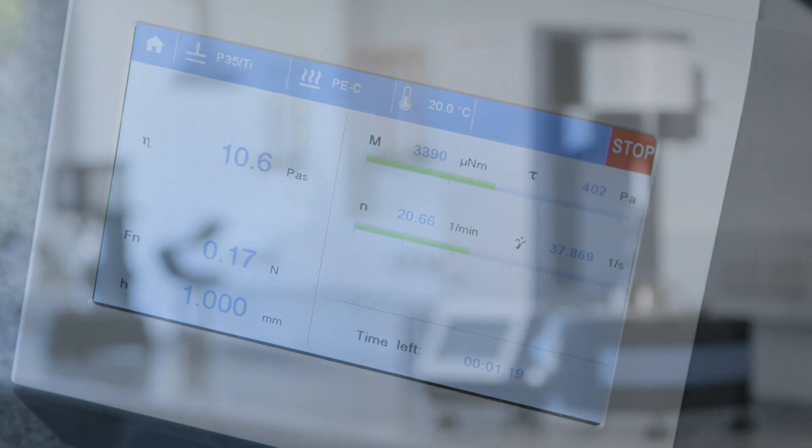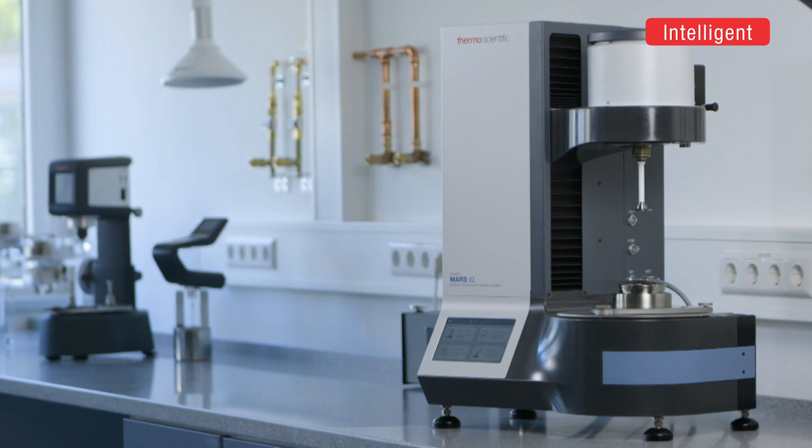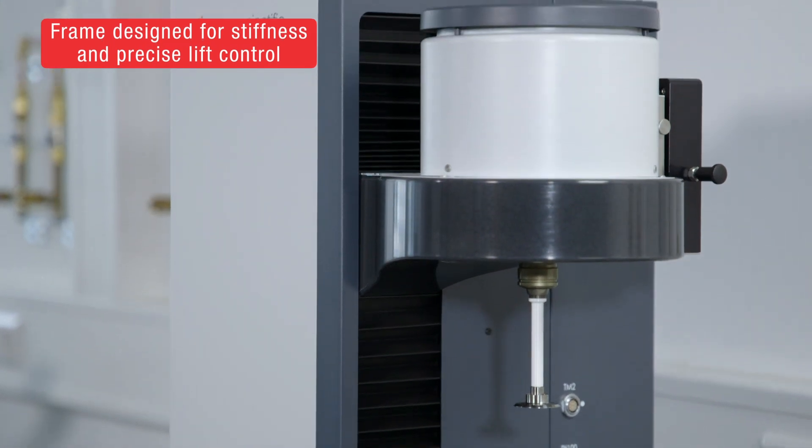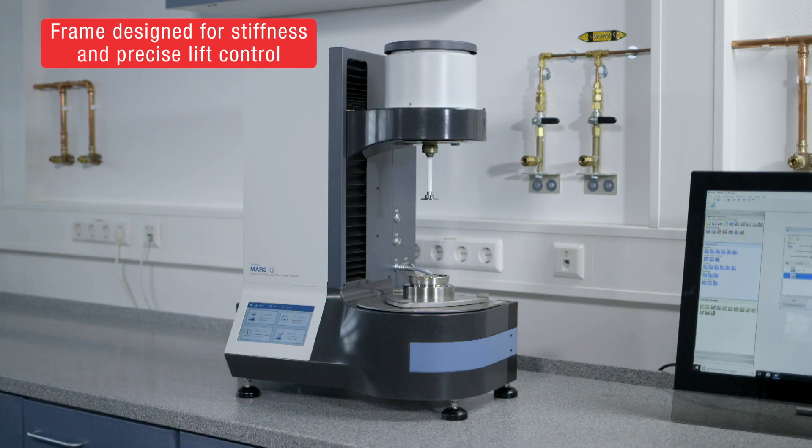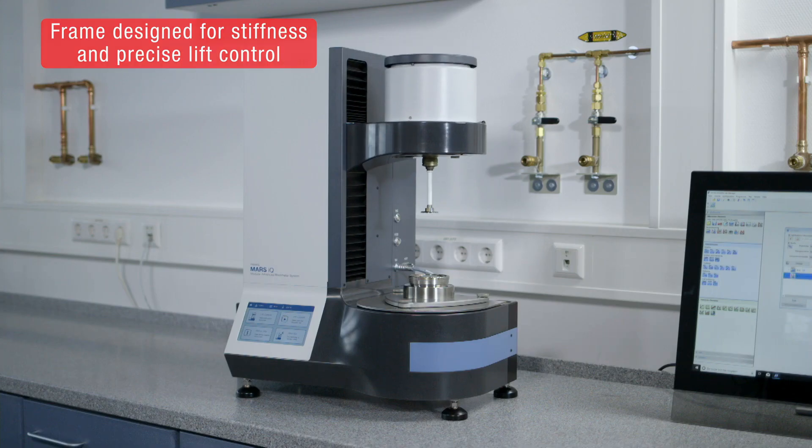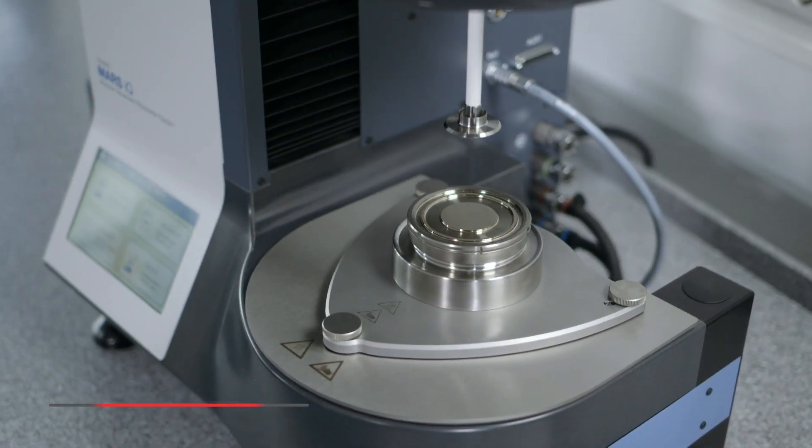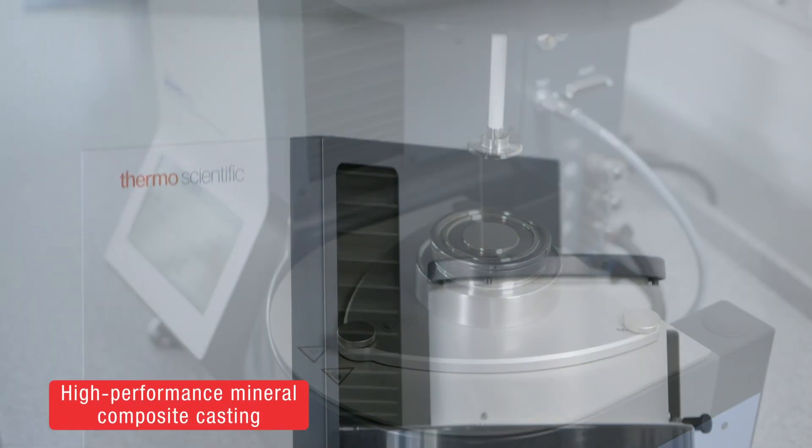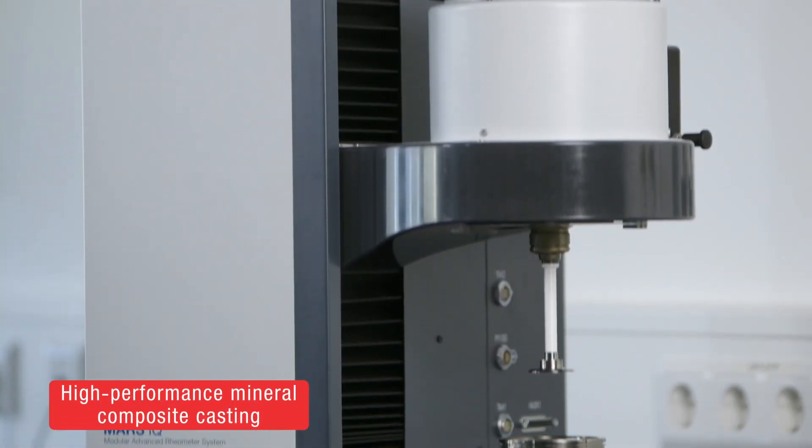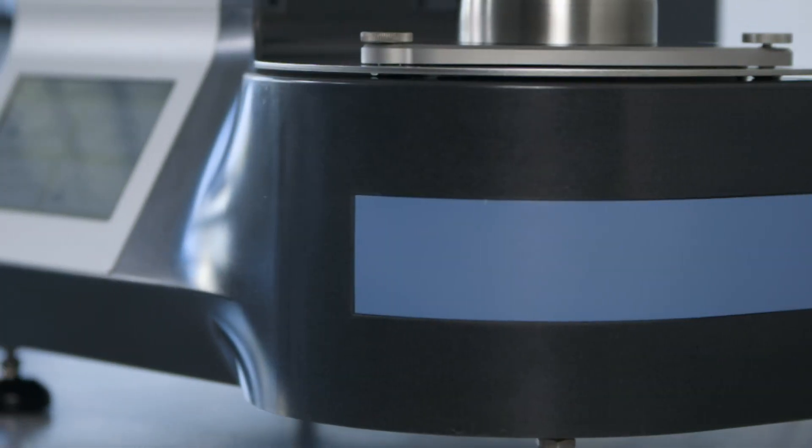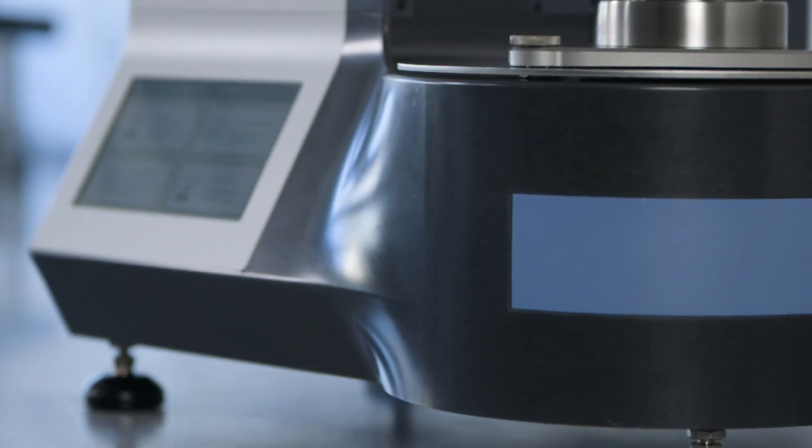The HAAKE MARS iQ Rheometer has an intelligent design making it robust for daily challenges. The instrument's folded H-frame combines greater stiffness and ultra-precise lift control with a wide travel range. The rheometer is made with an innovative high-performance mineral composite casting with exceptional properties such as high vibrational damping, minimal temperature expansion, and maximal chemical resistance.